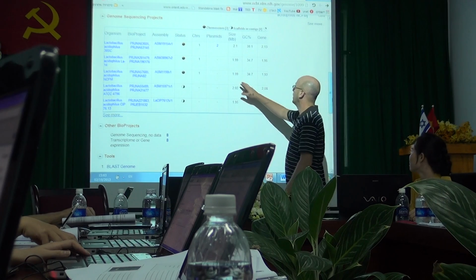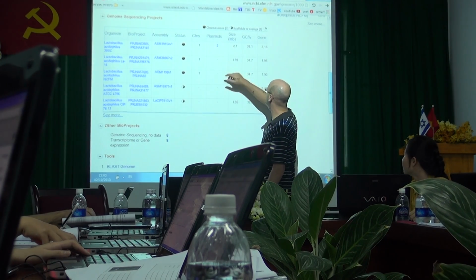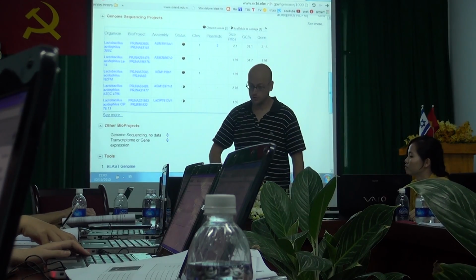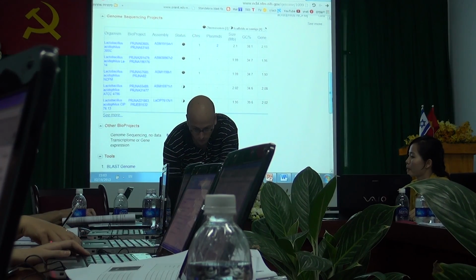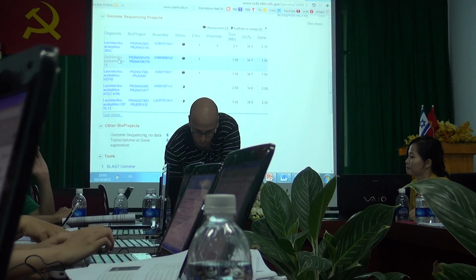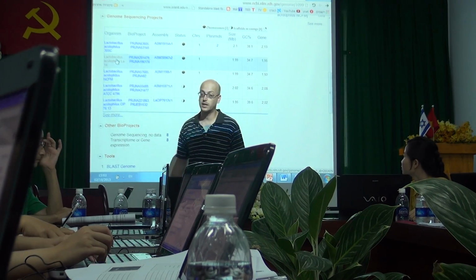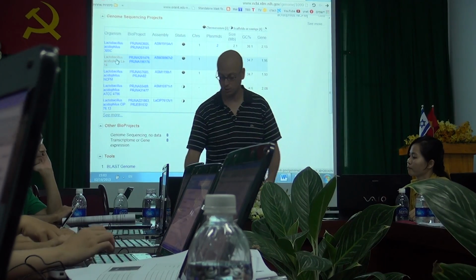And you have, of course, the size of the genome, the percentage of GC, the number of genes. And if we want to look inside, all we have to do is click on one of the genomes.